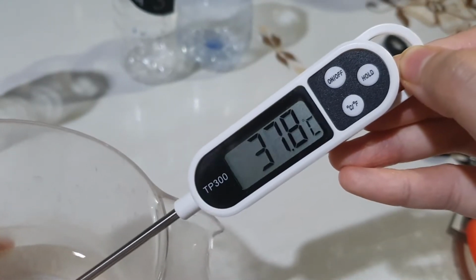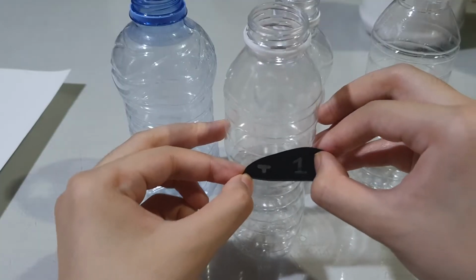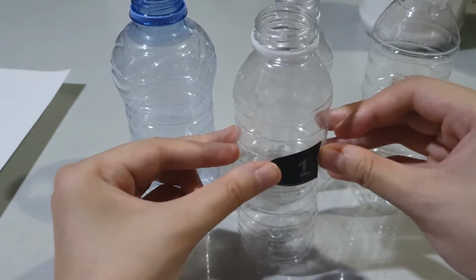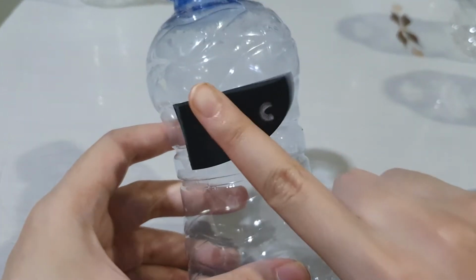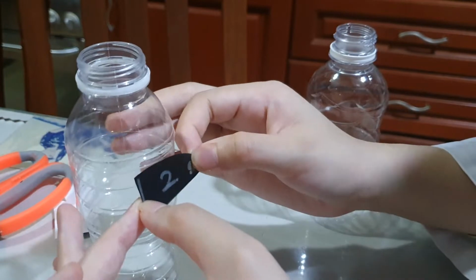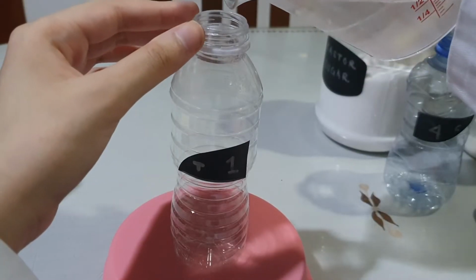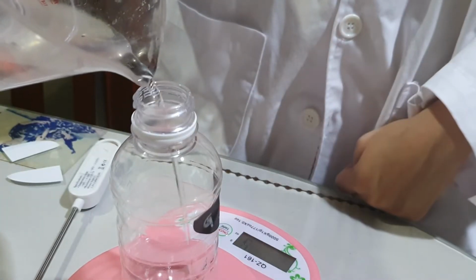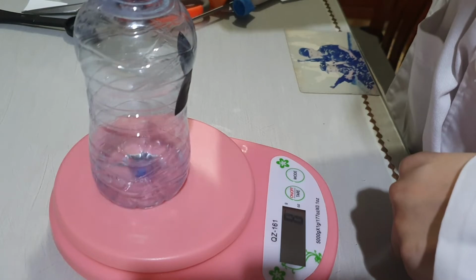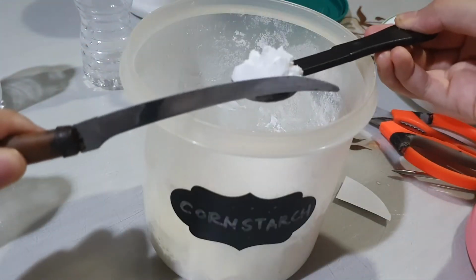I use a thermometer. First and foremost, I put on my lab coat neatly. Then, I label all the empty bottles from number 1 to 4. I also included the initial letter of the sample I'm using in the label so I don't confuse it. Then I filled all the bottles with 10 milliliters of warm water. Then I added 3 teaspoons of the carbohydrate sample into the bottles accordingly.